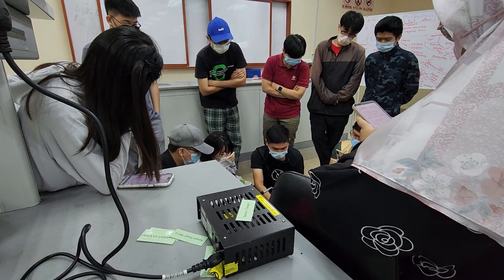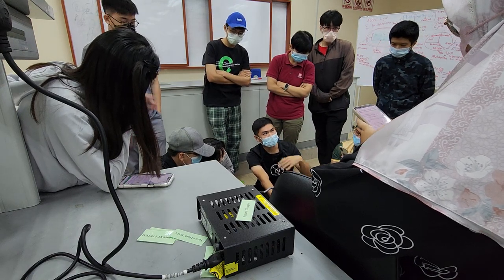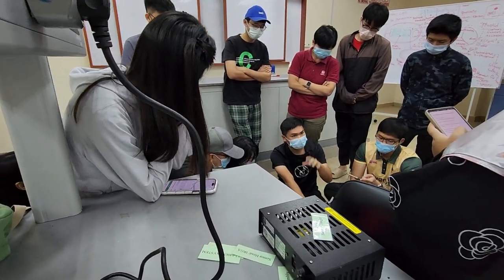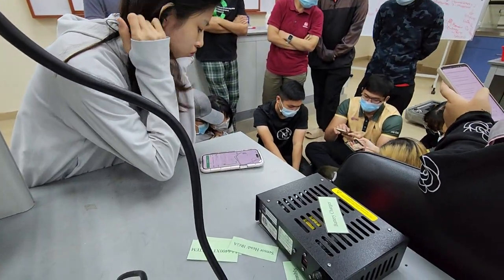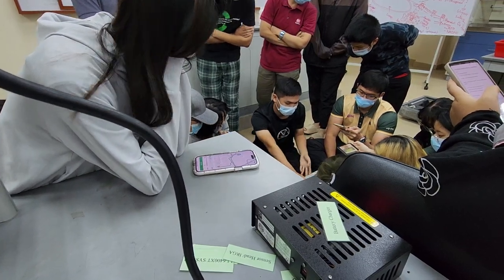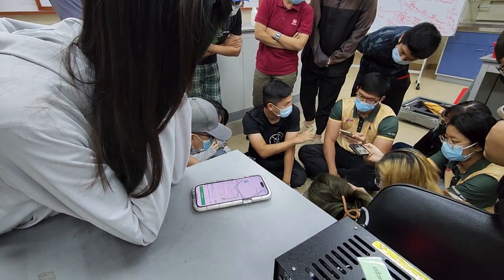So when do we take the data? The reading is taken when you press log. Log means to capture that point. So what is the optimum time? You press this square bracket. There is photo and COND. Photo here stands for the carbon assimilation, which is the photosynthesis.